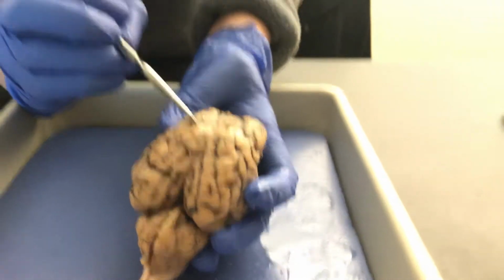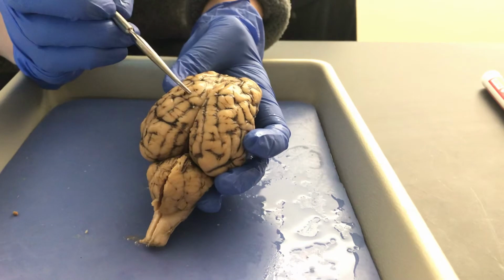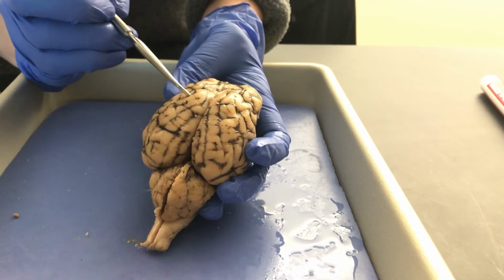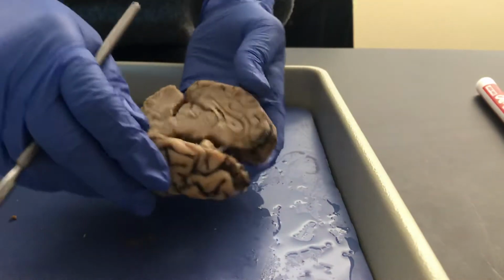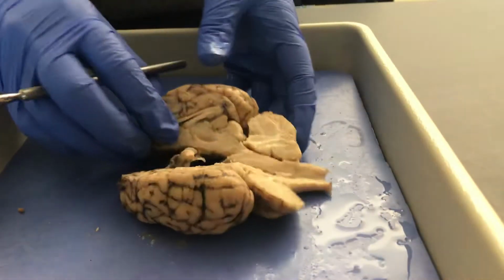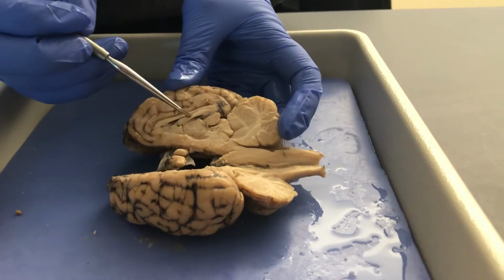The folds that you see of the gray matter, those are the gyrus or gyri, and then these little valleys are the sulcus or sulci. Then if we cut it open and look on the inside, okay, you will see the corpus callosum.